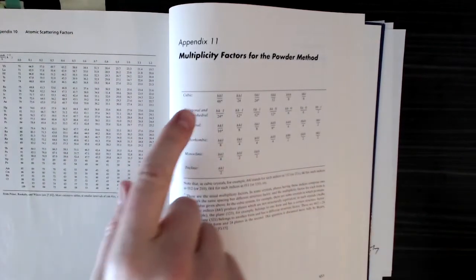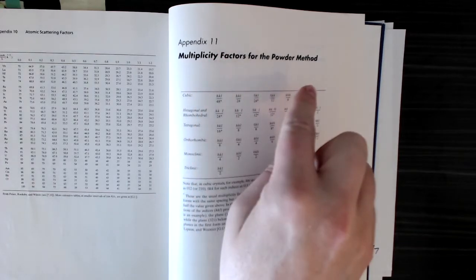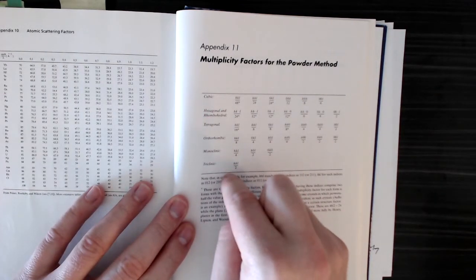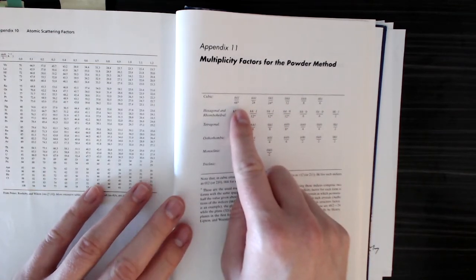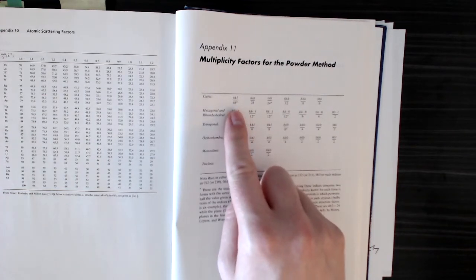Going back to Cullity, this time appendix 11. This is the multiplicity factor for powder patterns, and you can see it gives you not only cubic but other structures as well. Over here, it gives you the type of plane, and then the multiplicity factor below. If it's a generic set of HKL planes, then the multiplicity is 48.